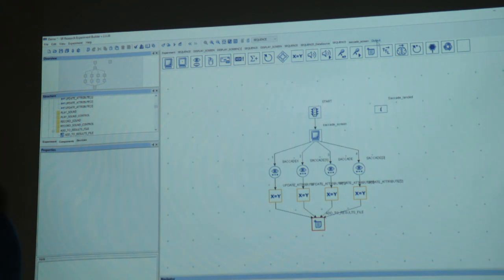Sorry? No, so when you click on this file, the clear input cues was ticked. The data would not come to the file. You have to untick it.